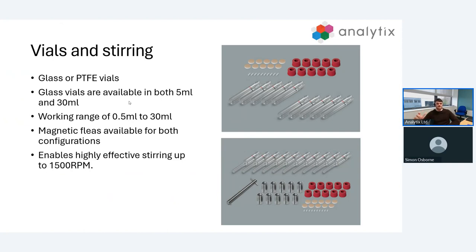These two vials give us a working range of 0.5 mils all the way up to 30 mils, and we have magnetic fleas larger and smaller for both of these variations that enable really effective stirring.